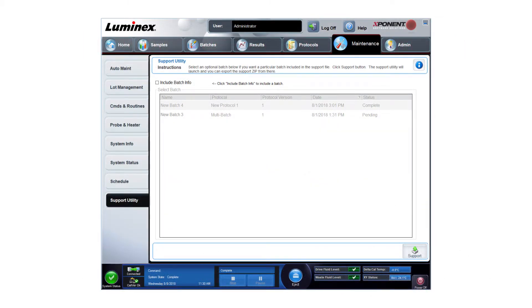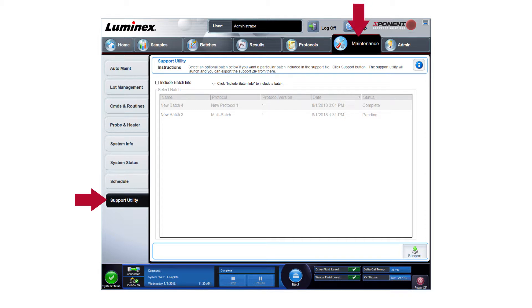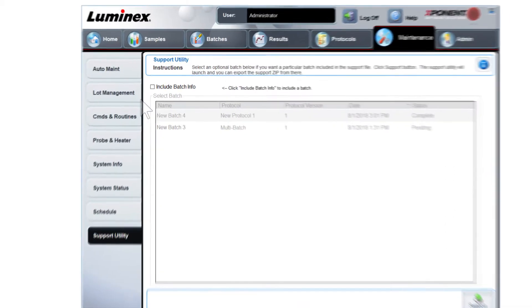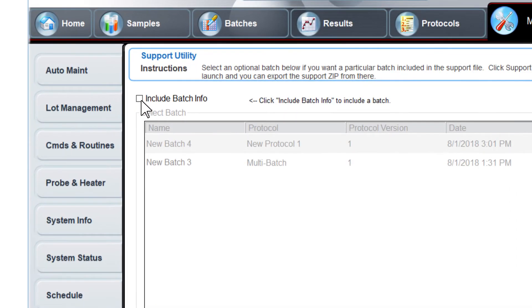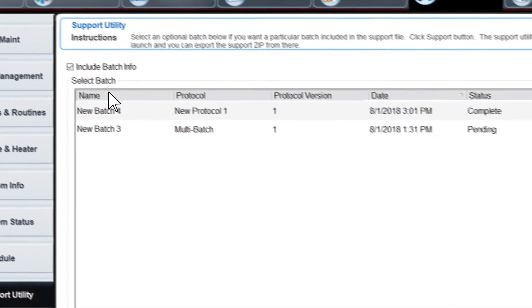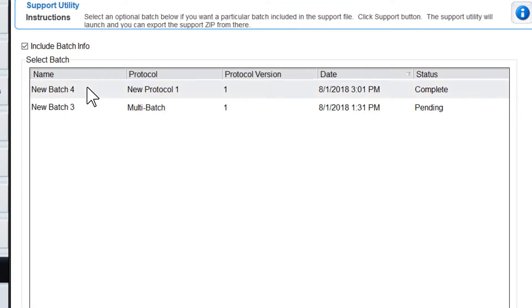First, from the exponent software, navigate to the support utility tab on the maintenance page. To include information within the file about a batch, click Include Batch Info, then select the batch name you want to include.